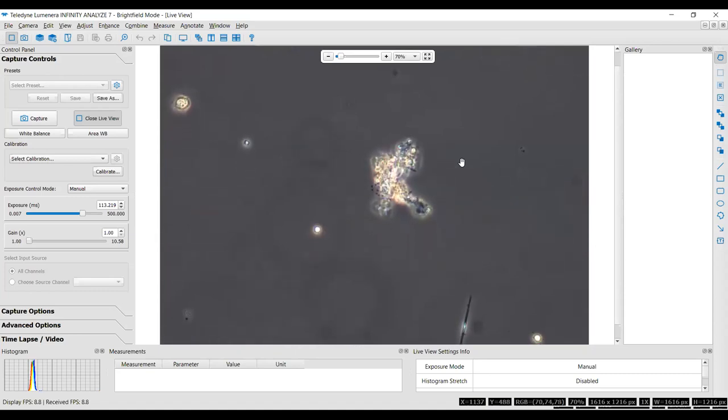And then more Crucigenia, a lot of diatoms. This is, you could call that Chlorella, or like me, you could call it little round green thing. I call those non-motile chlorophytes. Yeah, Chlorella is a way overused name. I don't hardly ever use it unless everything that's in there is the same thing. Otherwise, you don't know if it's a single cell of something else, and there's definitely more genetic variability in little green balls than Chlorella. So I don't use that name hardly at all. Yeah, I call it chlorophyte unicell sphere. Yep. There we go. Then we have chlorophyte, chlorophyte.